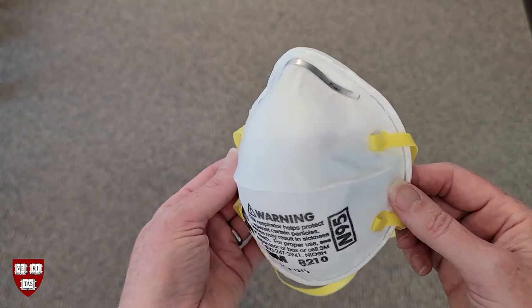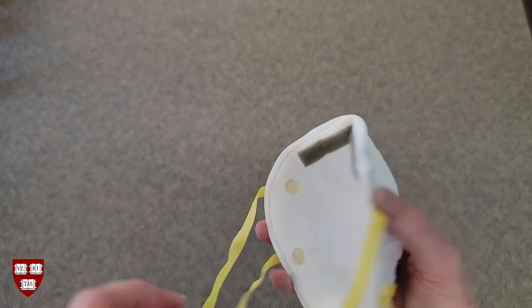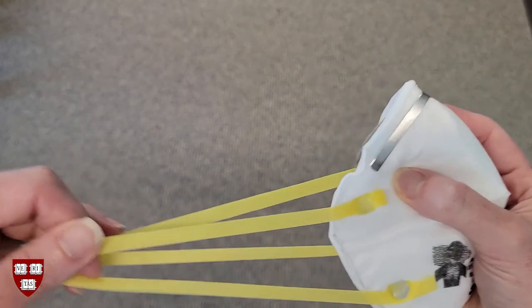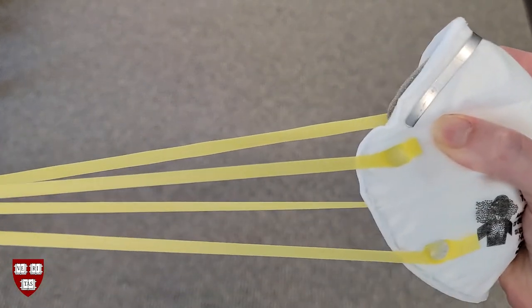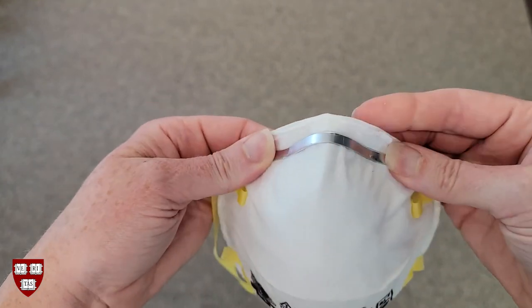First, thoroughly inspect the filtering facepiece. There should be no tears or visible damage to the facepiece body. The shape should be intact and not warped. The straps should be elastic and should not break or pull off the facepiece body when you tug on them. The nose clip should be securely fastened to the facepiece body.